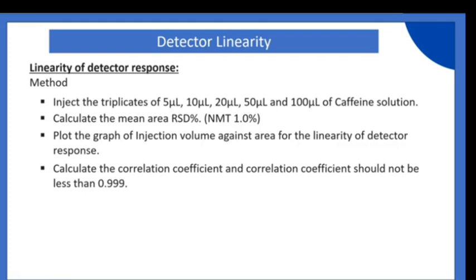In this test we cover both injector and detector linearity, as we plot the graph of different injection volumes and compare it with detector response.